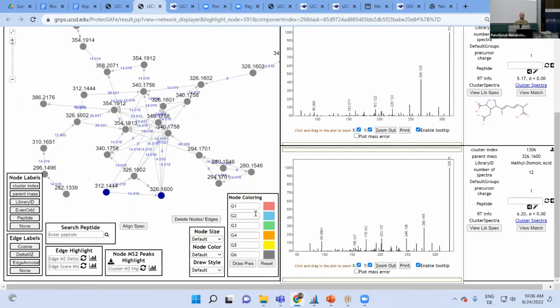And then the same for the blank subtraction. I think with classic molecular networking, you can do that. For feature-based, I don't know, and I would also not recommend it.